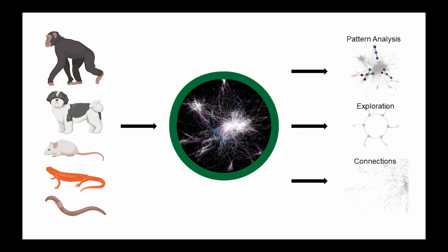Metaboverse is a user-friendly tool that enables pattern analysis of your data on the metabolic networks of around 90 organisms currently, with updates planned for the near future to enable the analysis of more organisms from other databases. Metaboverse automatically and rapidly identifies a variety of regulatory and other patterns in your data and provides additional visualization tools to further explore these patterns.